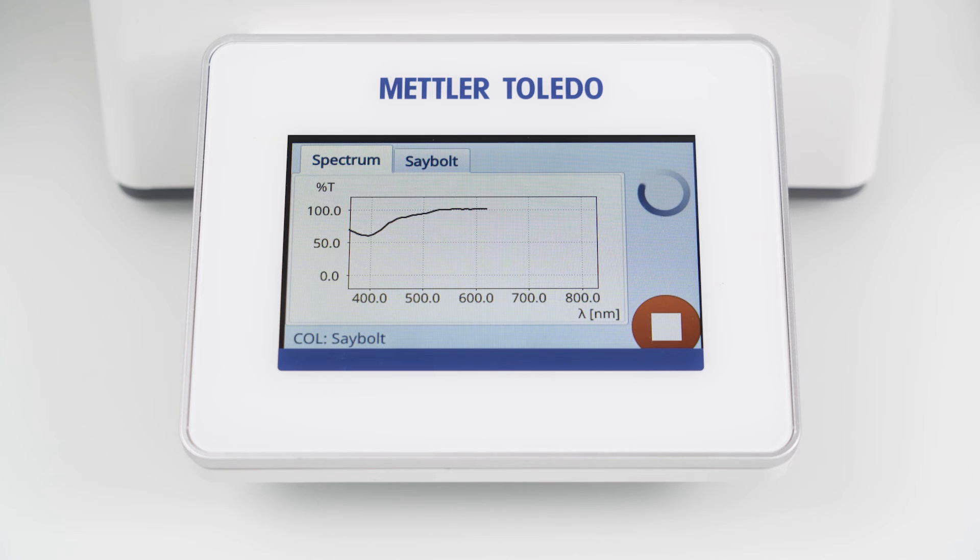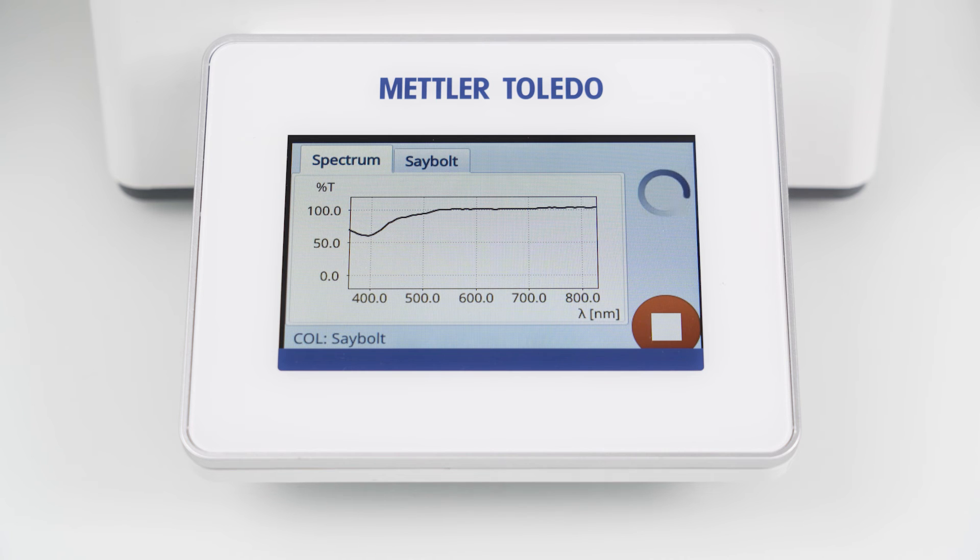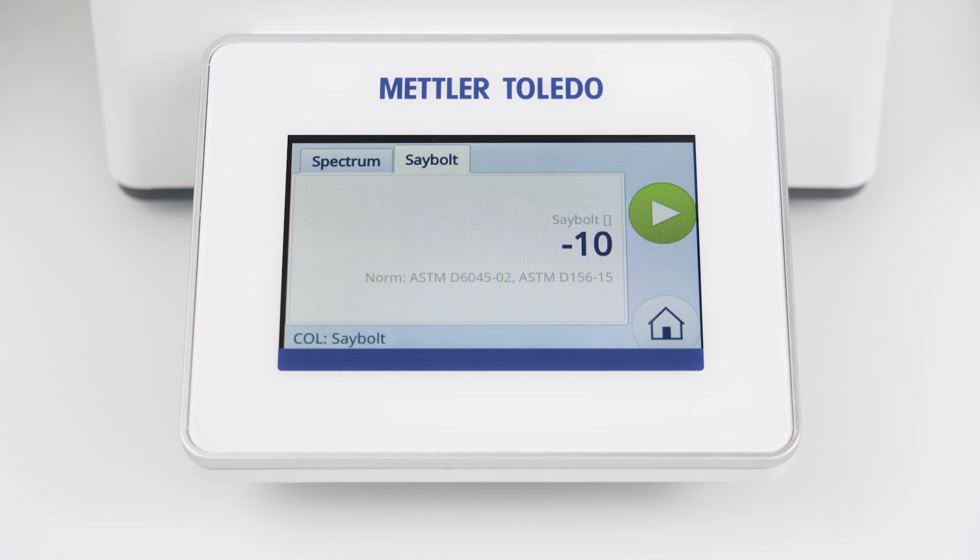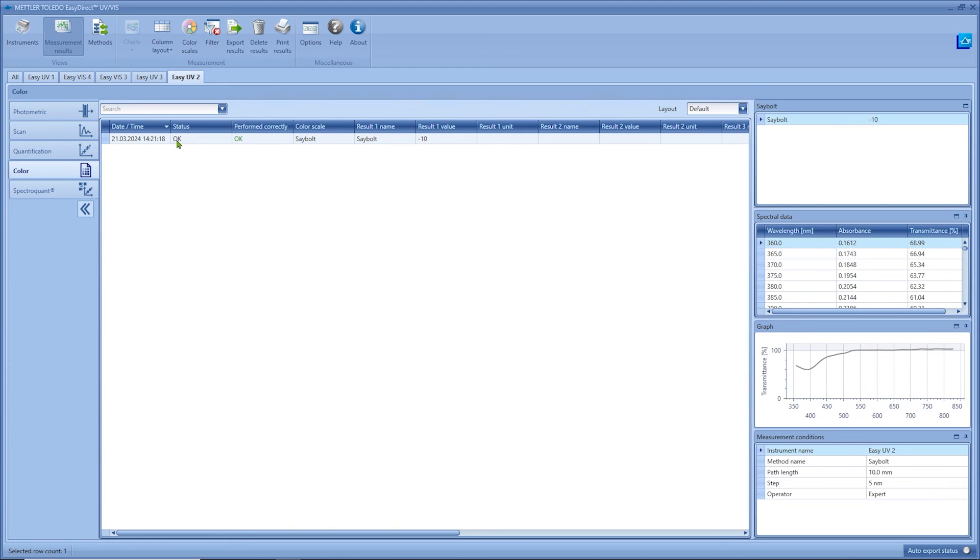I initiate the measurement by starting the prepared Seibold method on the instrument and you can see the spectrum on the screen. As soon as the measurement is finished the color result is displayed and transferred to the EZ Direct PC software. Here we can see now the measured spectrum and the corresponding Seibold color result.